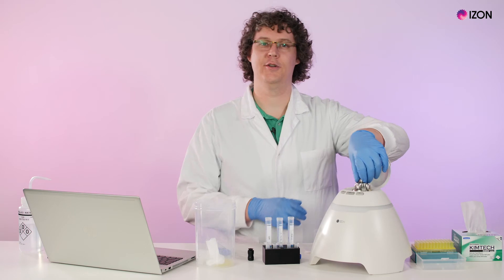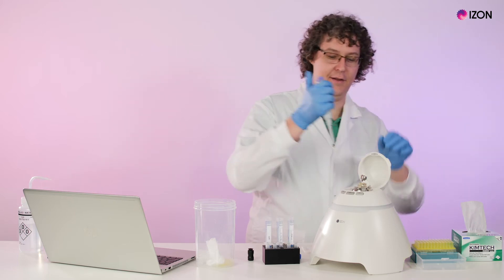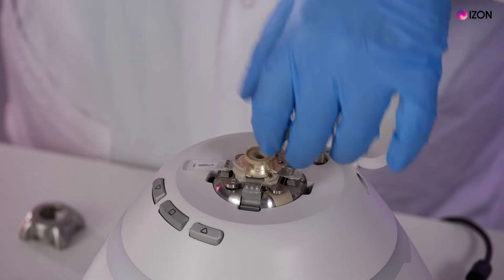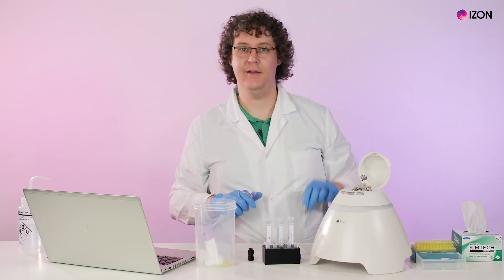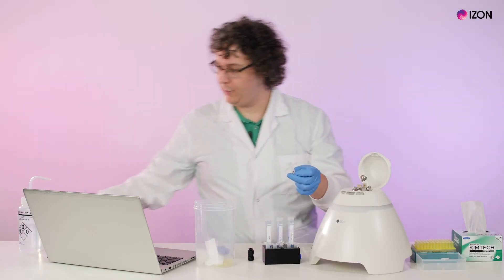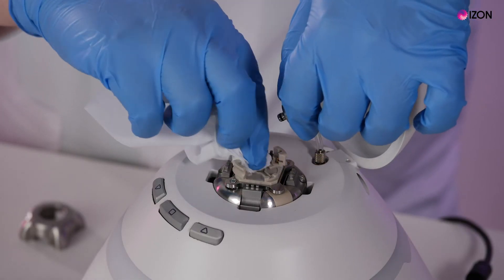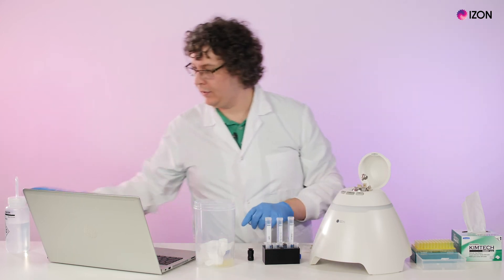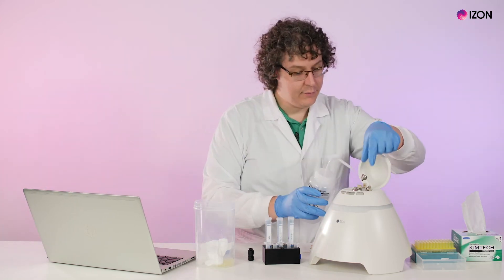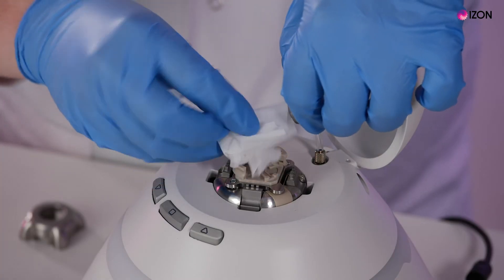Remove the pressure nozzle and the shielding cap, then remove the coating solution from the upper fluid cell. Remove the upper fluid cell and remove the nanopore. Rinse with deionized water and dry with a lint-free tissue or a nitrogen gun. Remove all residual liquid from the lower fluid cell, rinse it with DI water, and dry with a lint-free tissue.